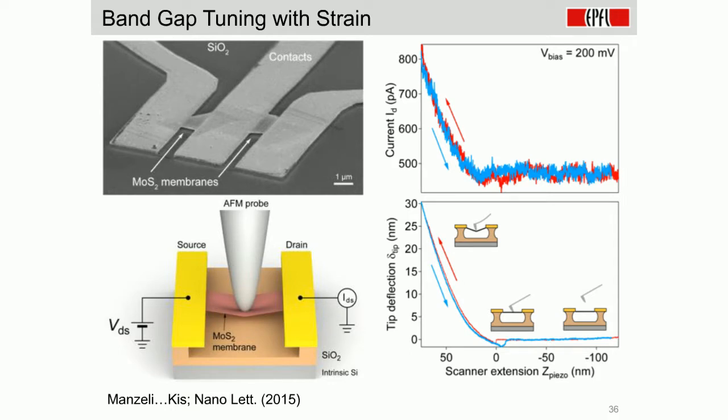Now on the top you have the current, which is recorded at the same time. It's a bit noisy, but the current levels are very low, in the picoampere range.